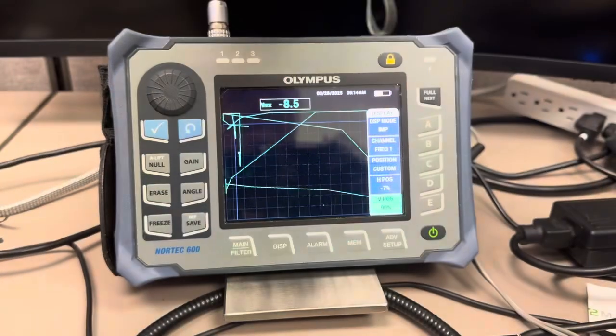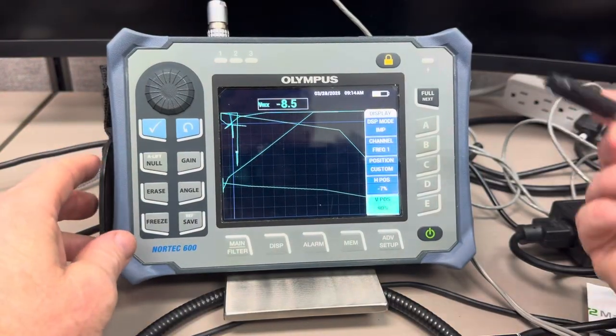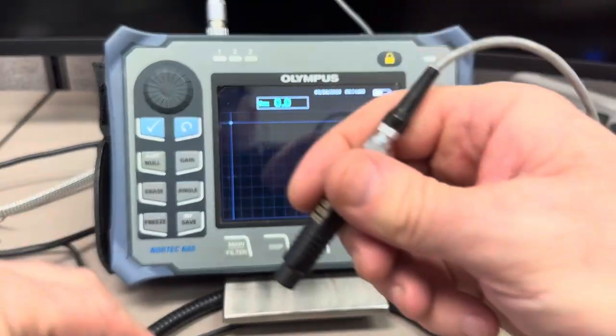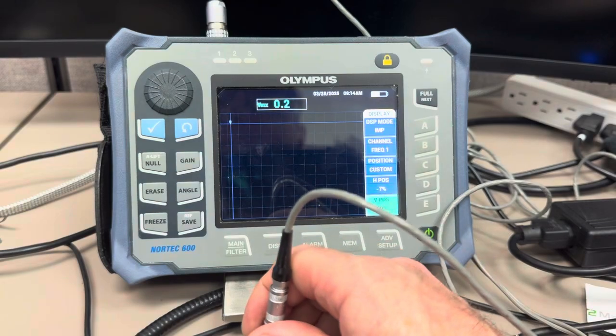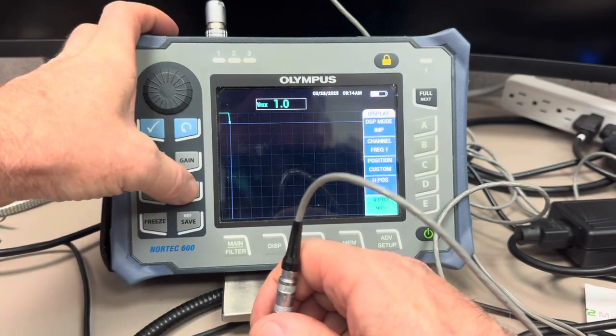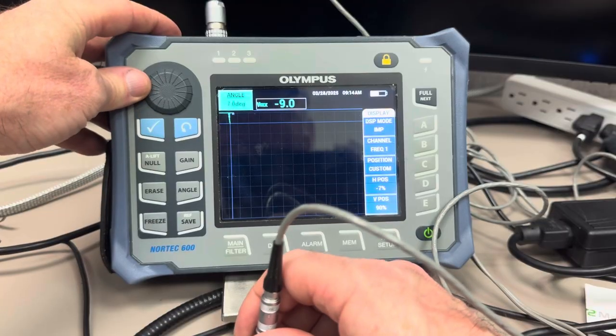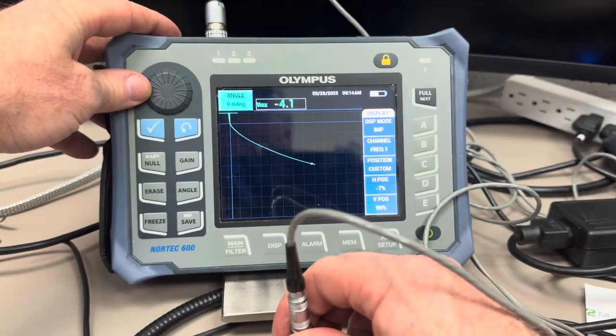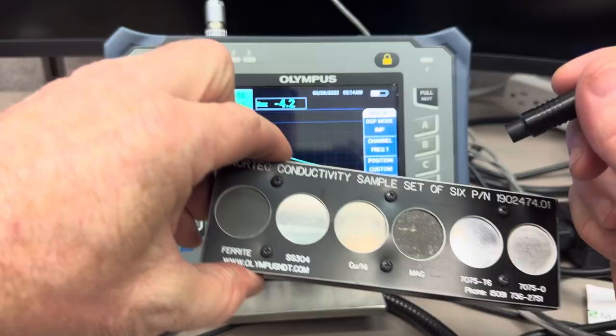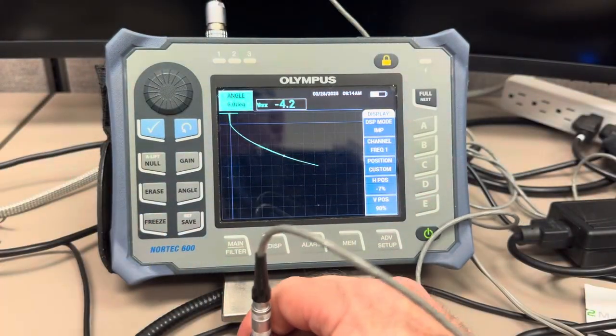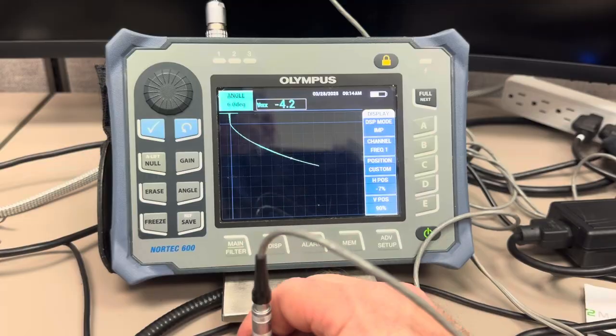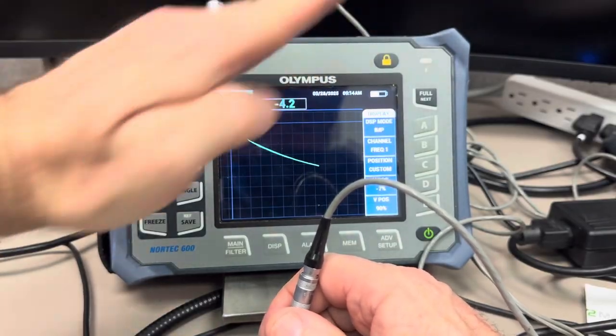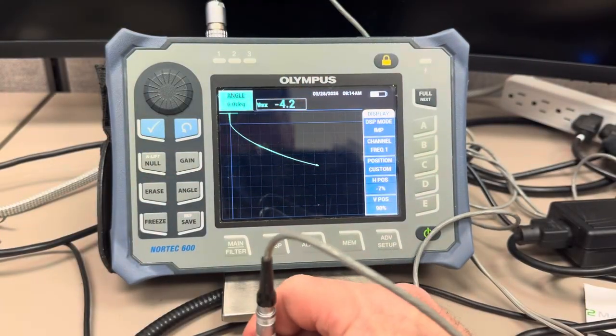All right. Now that probably changed my operating point. So it's going to go up. So it's almost phased the right way but I'm going to adjust it just a little bit so it goes like straight up. And it doesn't really matter that we can't see the rest of the signal but it's vectored up. All right. That's me touching the probe to 304 stainless. And it's going down to the right because that material is non ferromagnetic. If it was magnetic it would be having a trajectory more up and to the right. But because it's non ferrous it goes down to the right.